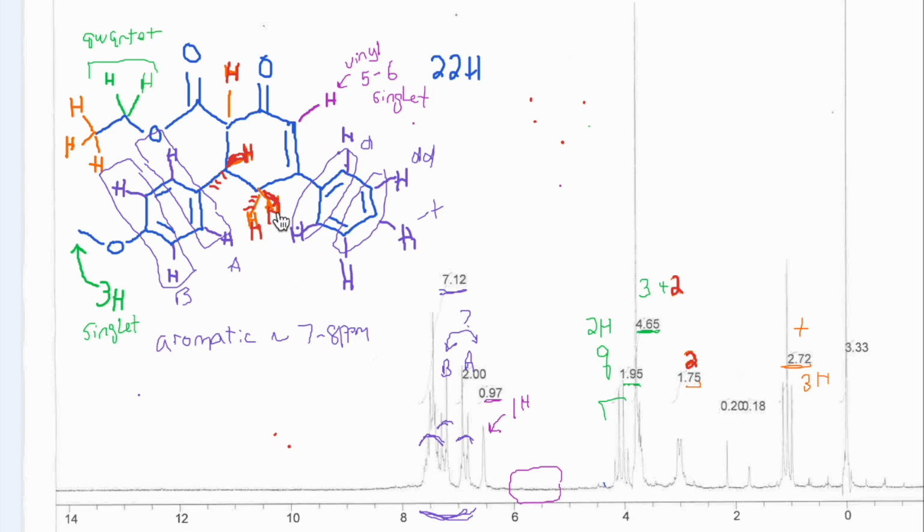They're actually different hydrogens. So we've already used up A and B. Let's call this C and D and E and F. So let's just say that these are C, D, E, and F. They are all different. So this hydrogen is going to be split into a doublet by its neighbor D, and it's also going to be split into a doublet by its neighbor E. So hydrogen C would be a doublet of doublets. Hydrogen D would be a doublet of doublets.